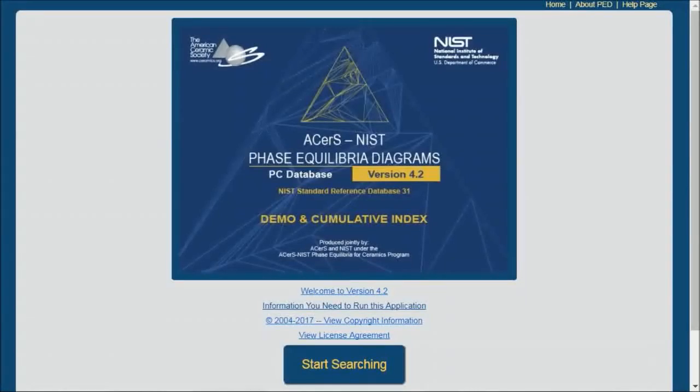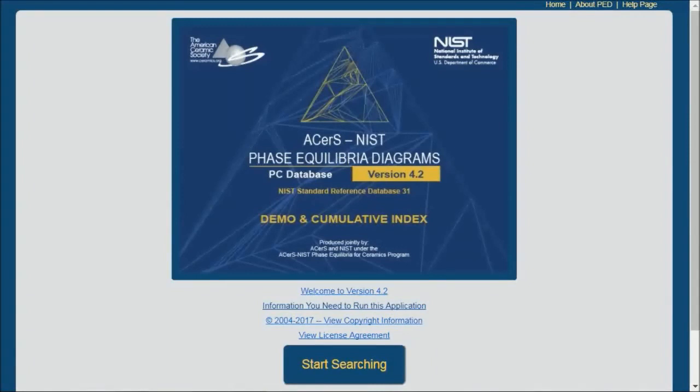Welcome to our demonstration of the ACerS-NIST Phase Equilibrium Diagram product. In this video I will show you some of the many options for searching for these diagrams.